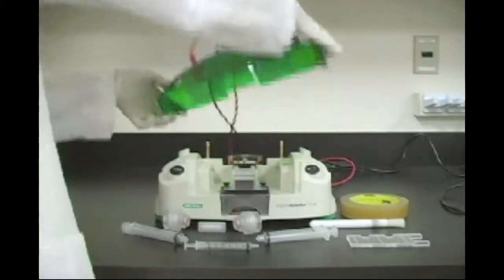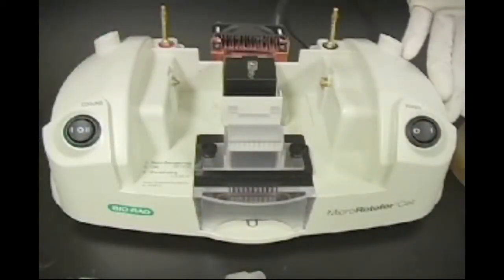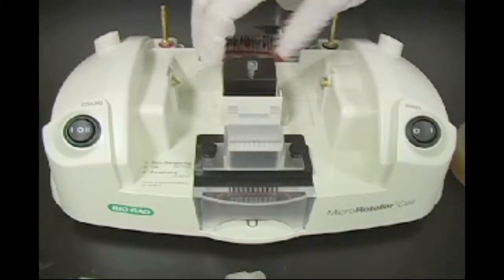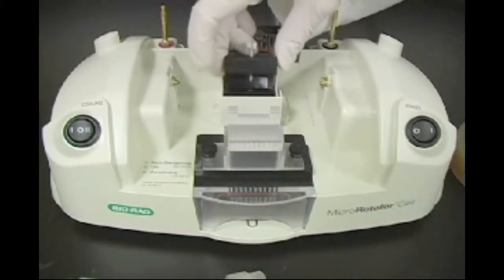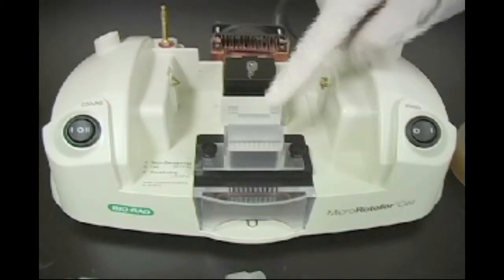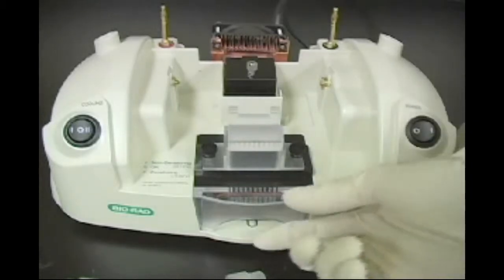The Micro Rotifor cell contains a number of components. The chassis is the base of the cell and houses the focusing station, which is used during separation, and the harvesting station, which collects fractions from the focusing chamber after fractionation is complete.